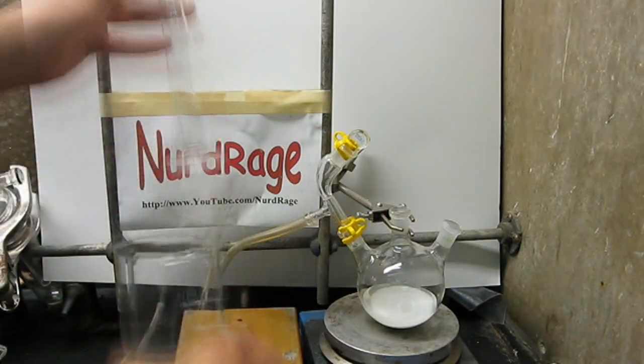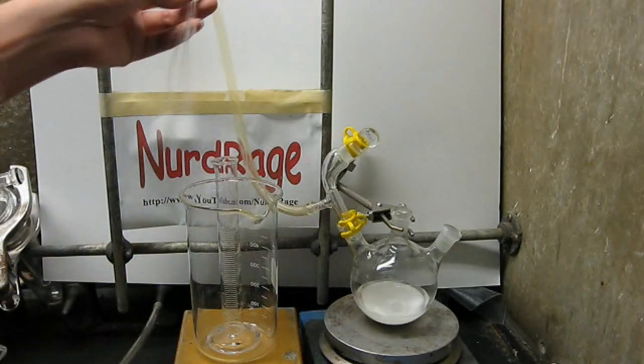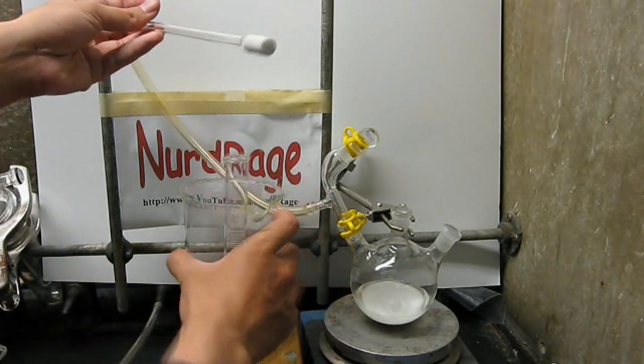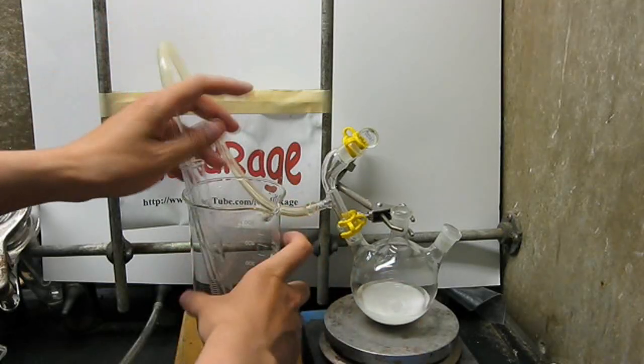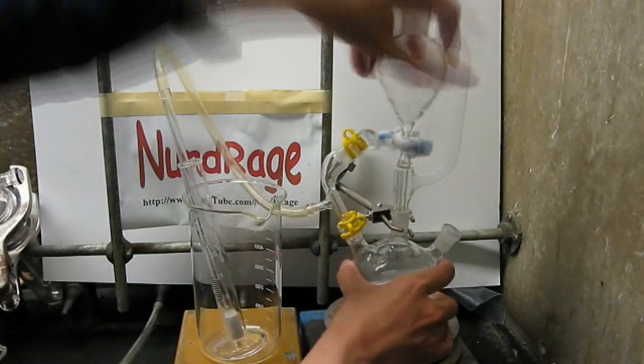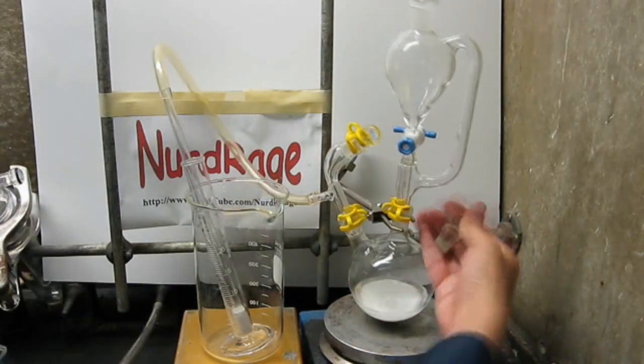Now get a 25 milliliter graduated cylinder and a beaker that will fit it. Our gas outlet tube has a gas dispersion tube end, but you can use a straight tube if needed. Okay, lead the tube into the cylinder. Now connect a pressure equalized dripping funnel to the flask. Stopper off the extra neck of the flask.